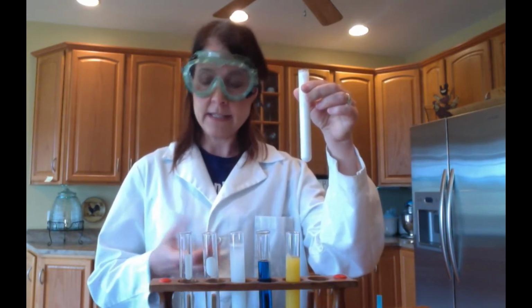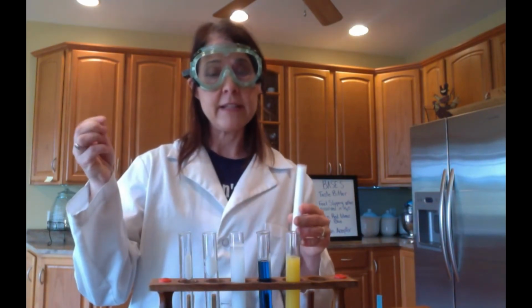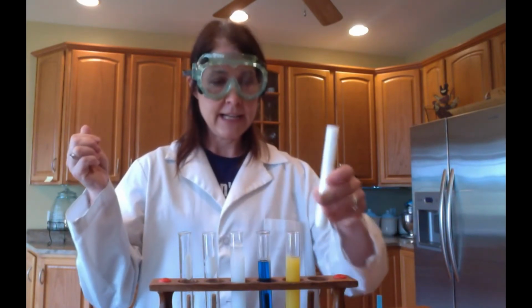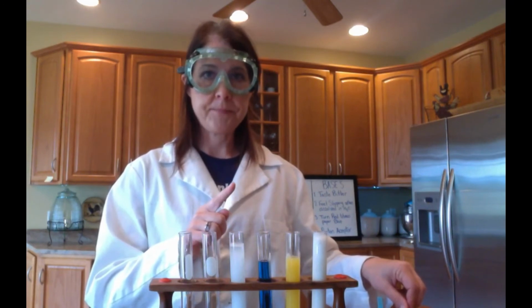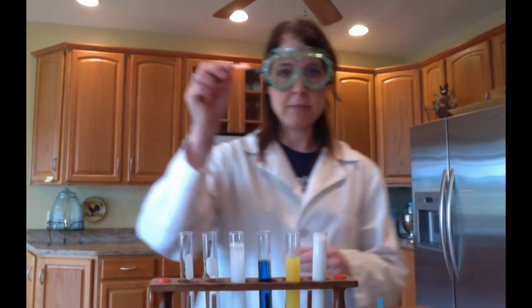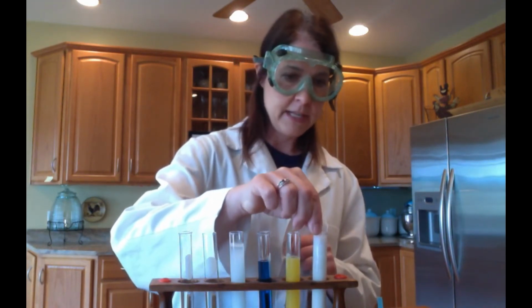I don't want to taste this, but I can go ahead and feel it. Put a little bit on my finger. And I can feel that it definitely feels slippery. I'm going to test my guess with litmus paper. If I think it's a base, I would use what colored litmus paper? Red, that is correct. So I'm going to take a sheet of red litmus paper, and when I put it in a base, it should turn the litmus paper what color? That's correct, blue. So I'm going to slip it in there.